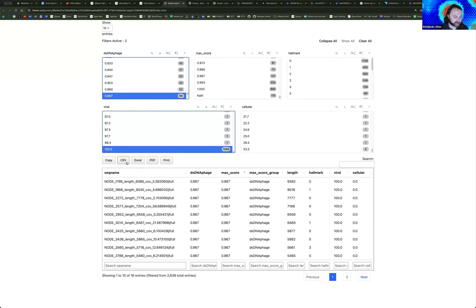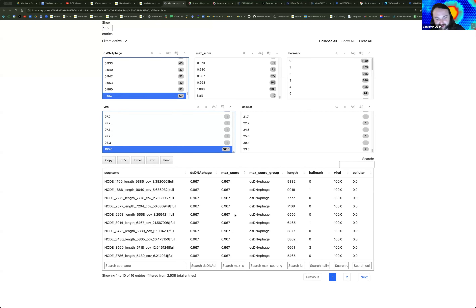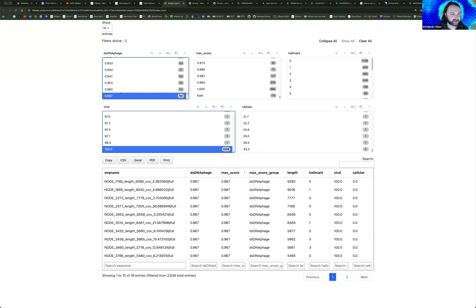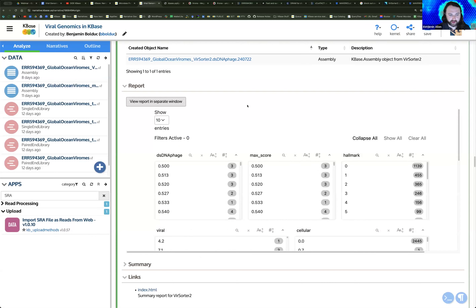You can use different filters to select or identify different contigs on your assembly. There's an export option if you want to download these as an Excel or CSV file to explore outside of your web browser, since these report viewers can sometimes be challenging for annotating your own records.